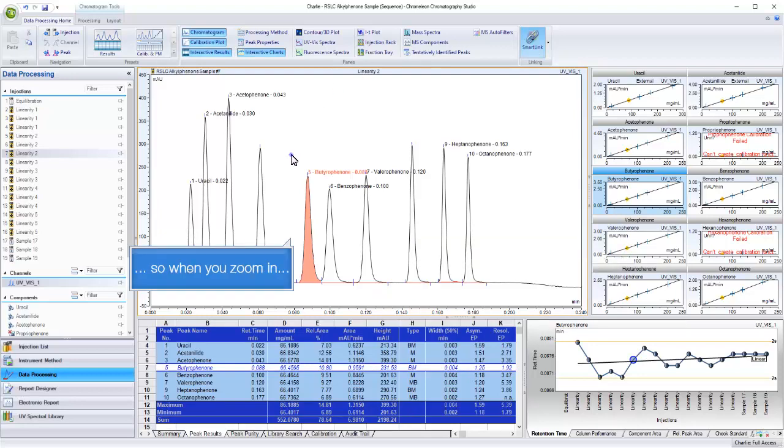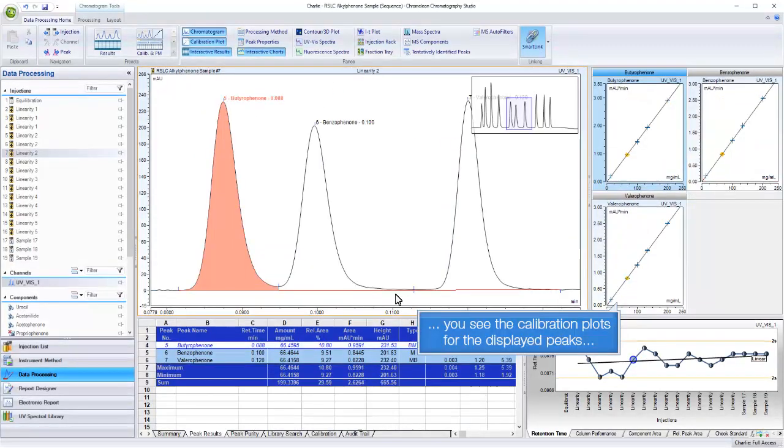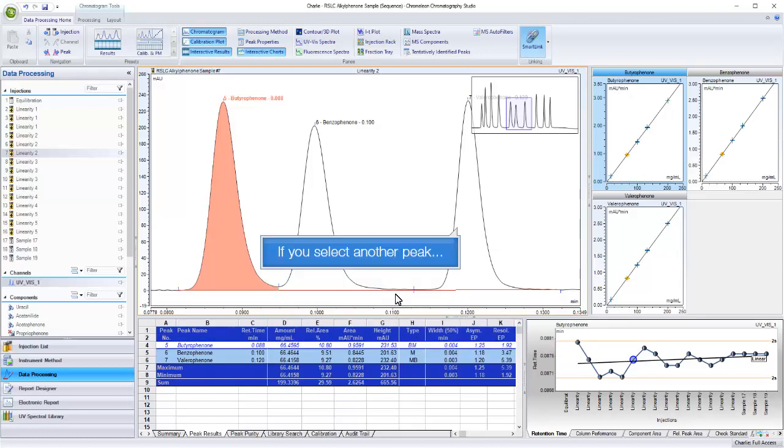So when you zoom in, you see the calibration plots for the displayed peaks. And the integration table is restricted too.